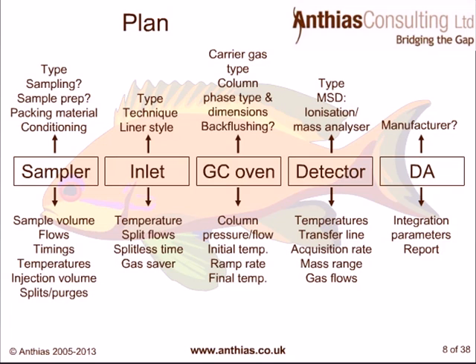So then below that we've got our individual parameters for that. So thinking about things like sample volume, any flows, any timings, any temperature, injection volume, if it's something like headspace, any splits, purges, etc. And these sorts of parameters are very, very dependent on which type of sample preparation or sampling technique we've chosen to use for our particular application.